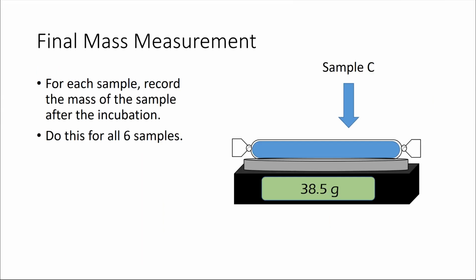At the end of 30 minutes, we're going to take those dialysis tube pouches out of the solution they were in and get what's called the final mass measurement. And we're going to do this for all 6 samples, recording individually how much the mass of that dialysis tube pouch was after a 30-minute incubation.